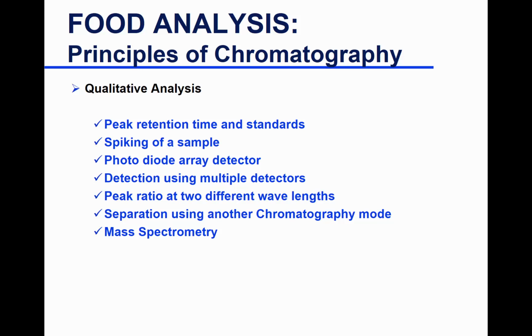Photodiode array detector, and I talk about it more in detail in the HPLC and in the spectroscopy lecture. It's a type of detector that is based on absorption of light. And in lab, two groups today, we talked about that. It's a type of detector that allows the production of a spectra, which is a scan of wavelength and absorption.